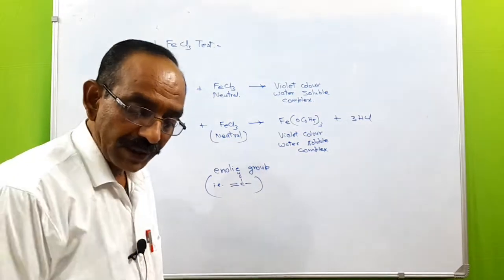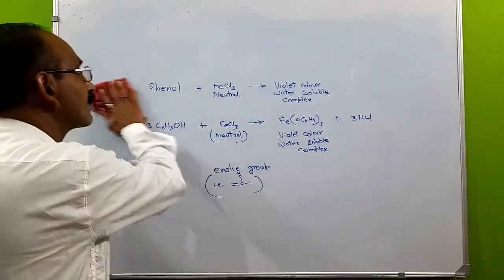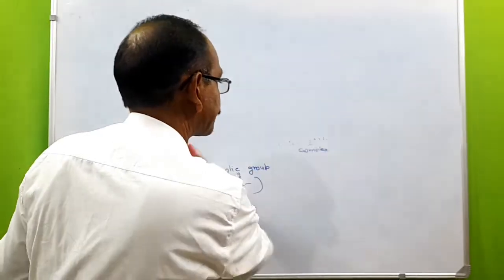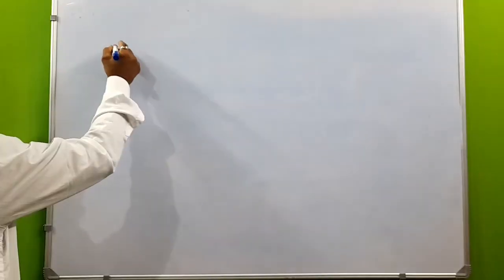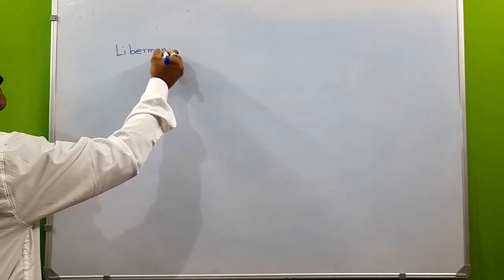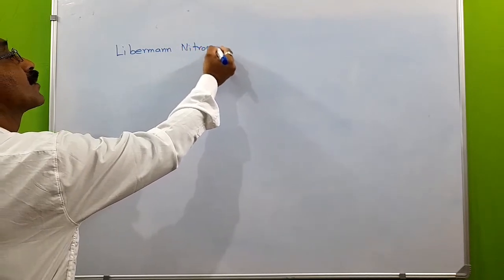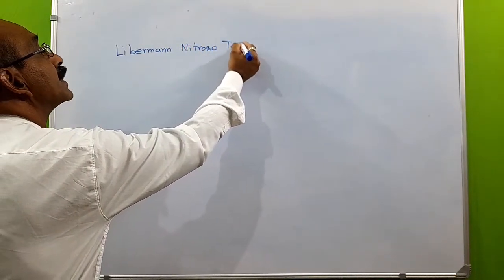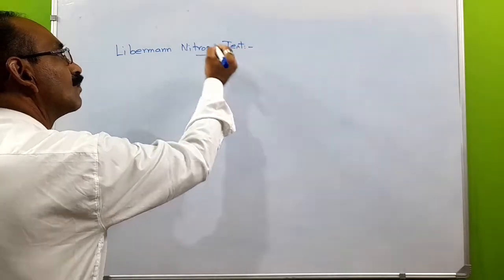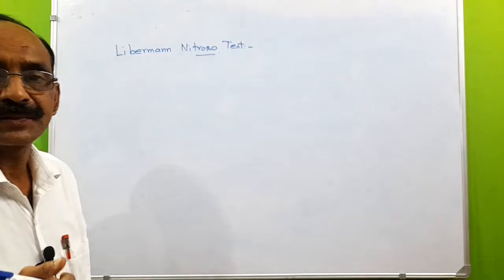We will discuss one more test here, and that one is the Liebermann nitroso test. Most of the phenols give this test.